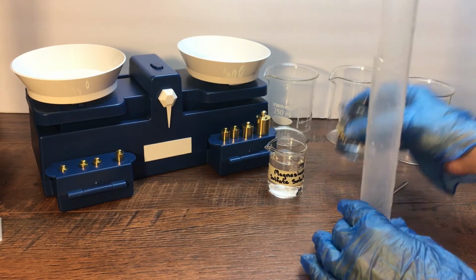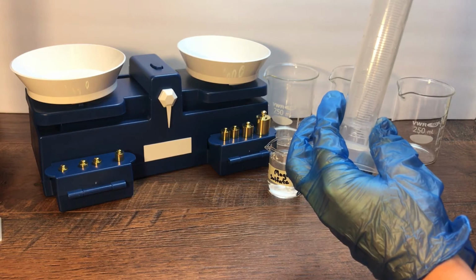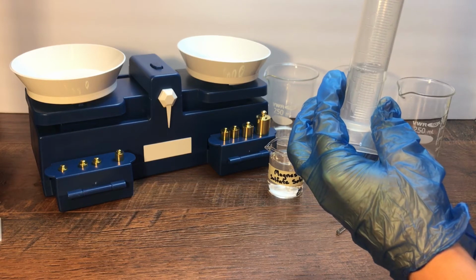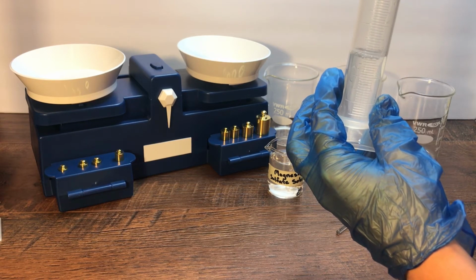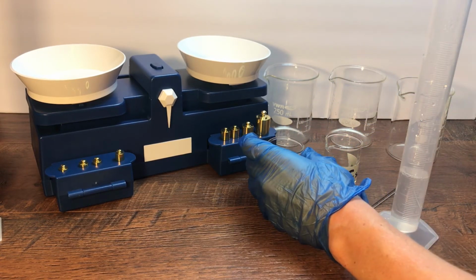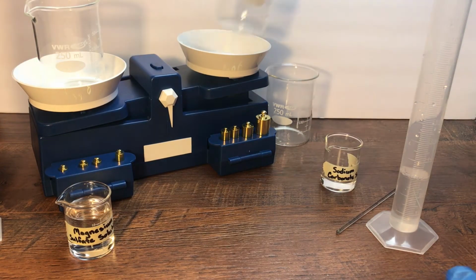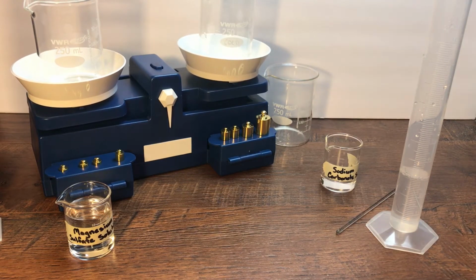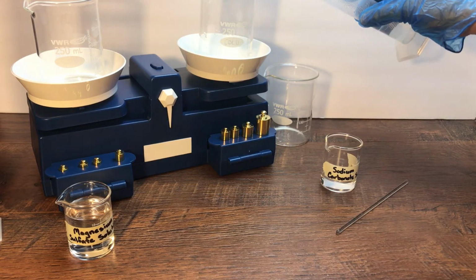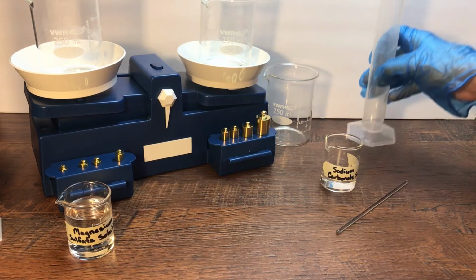So first, let's measure out 30 milliliters of our sodium carbonate solution. Now, in order to use this balance, we need to have a container. So we're going to put 2 equal containers on here, and they should balance out. And then we're going to place our sodium carbonate solution in this one. And we should be able to measure the mass.